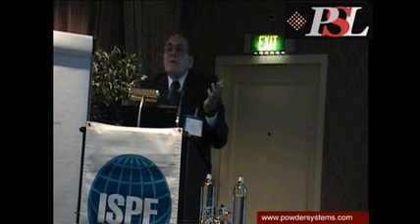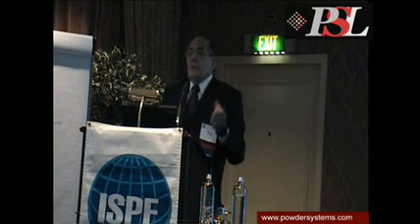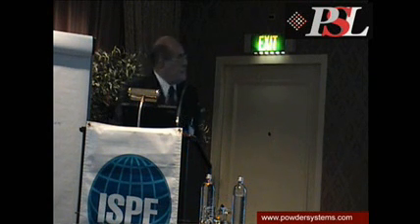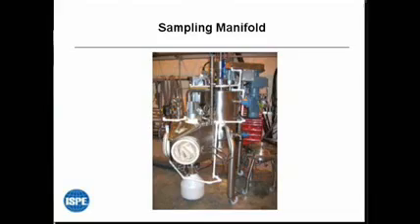So we improved our confidence interval in the data significantly. We were about 98% confident by the time we finished a couple of studies. We lost the first one, as you will see. So that's how we got out of the bias. And here's what it looks like. I don't like battery-operated pumps.